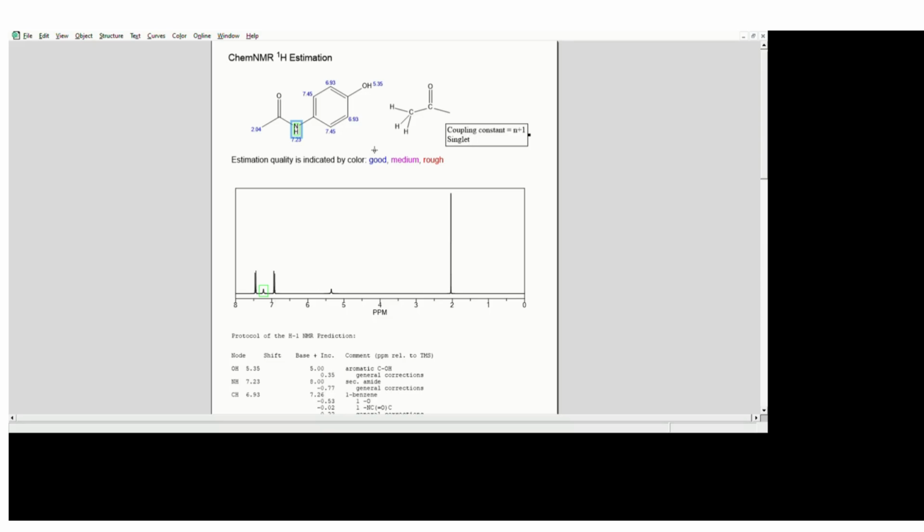Okay. In this way, now you need to tell me how many protons are there in the structure. In total, there are 9 protons present. Out of which 3 are aliphatic, 2 are free, and 4 are aromatic. So, in the files, you need to write down their shift, their nature, the reference to those protons, and their coupling constant. Now you can pause the video, take your notebook and write down the points.